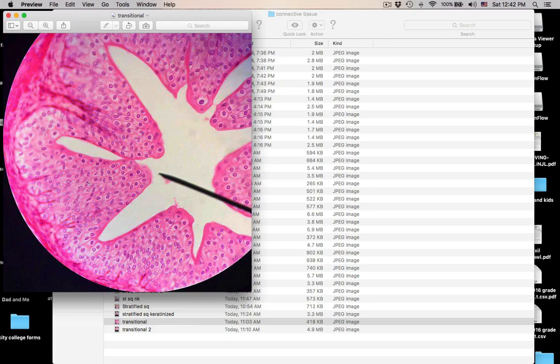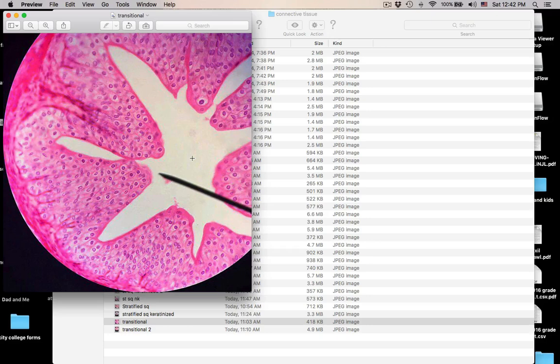Pointer in lumen. Basement membrane is somewhere down here. It's stratified, but look at those apical cells — weird-looking cells. What looks like this? Transitional epithelium. Found in the ureters, which take urine from the kidney to the bladder, and in the bladder itself. As more urine is collected, the apical cells transition from balloon-like dome-shaped cells to flattened cells. This is transitional epithelium.